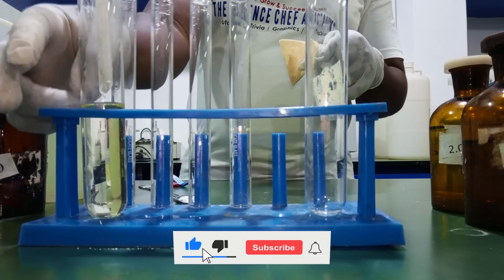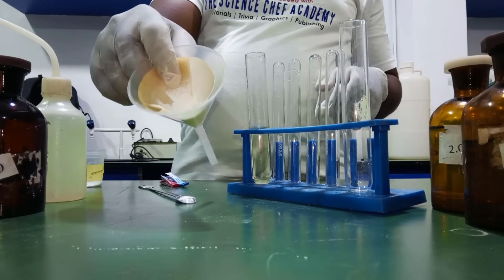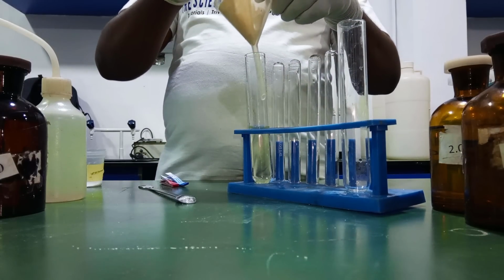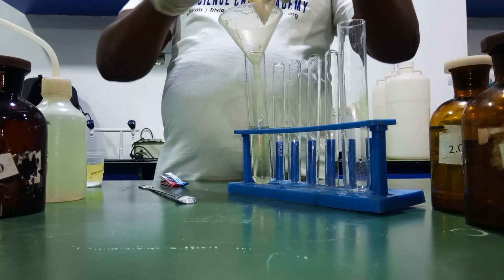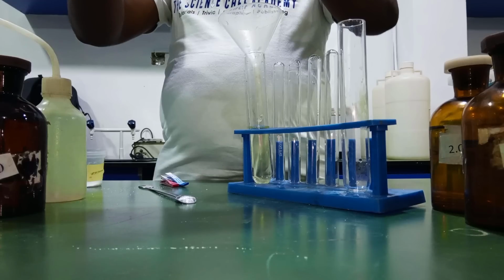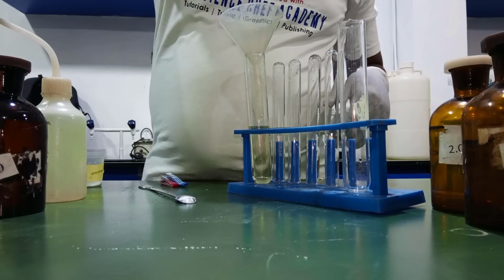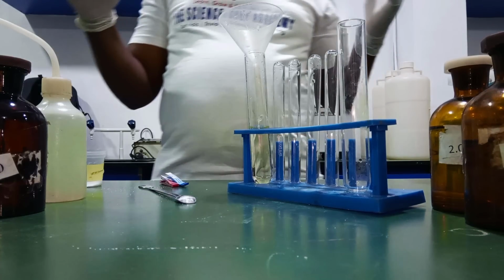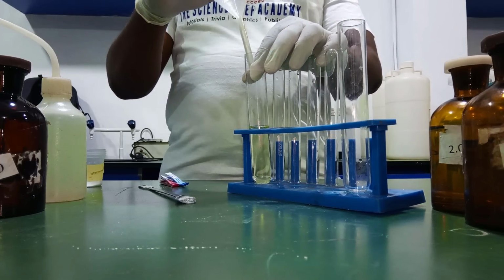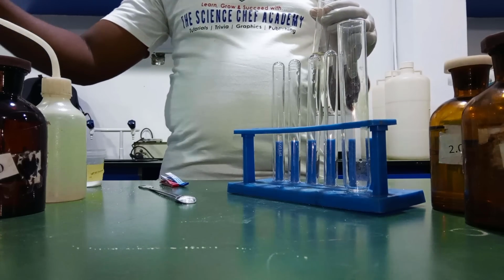You can see the filtrate there. And you can see our residue. Can you see it? Yes, you can see the residue. Good. I'm going to remove it and open it up to get dried a bit. So let it dry. At this point, you may need to switch on your fan, which can help it dry. So now, while the residue is drying, let's carry out the analysis on our filtrate.